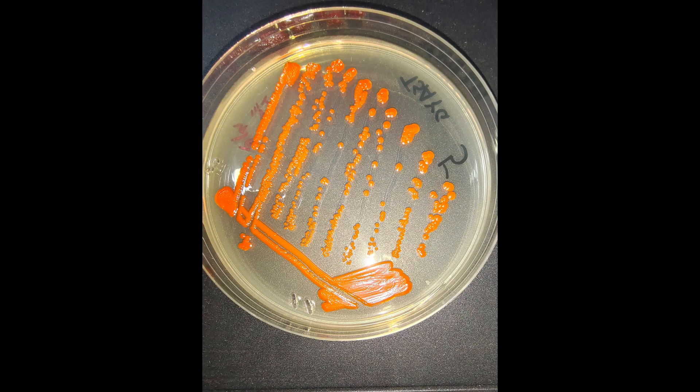So the fifth, also the last one, is this reddish color gram-positive bacteria, which at first I thought I found the bacteria I'm looking for, but it's supposed to be gram-negative, so this one must be something else. And the AI thinks it is Serratia, again it should not be gram-positive if it's Serratia, and I don't know why sometimes AI just does that.